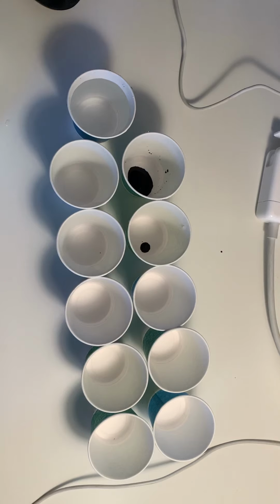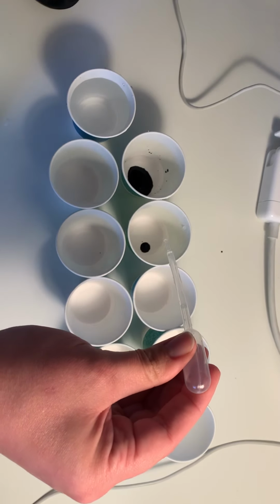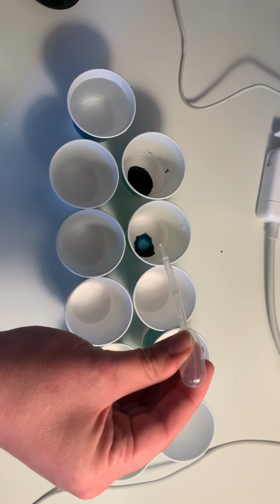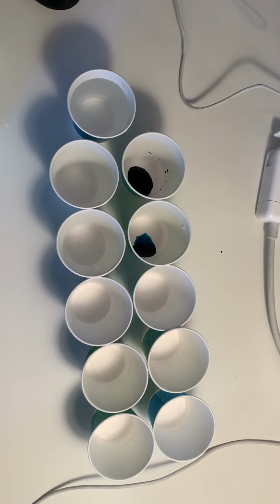Now I need to rinse off this pipette so that it's not colored anymore, which is going to be easier said than done. I have some water off screen here that I'm rinsing this out with. Now I'm going to suck up my water and add 9 drops to this. 1, 2, 3, 4, 5, 6, 7, 8, 9. So I have 9 drops of water and 1 drop of my 1 million parts per million. What I basically did is I diluted this by 10.